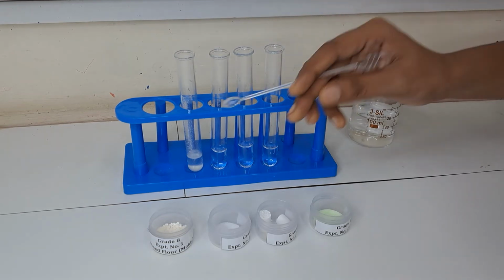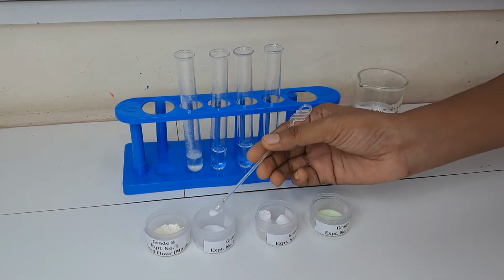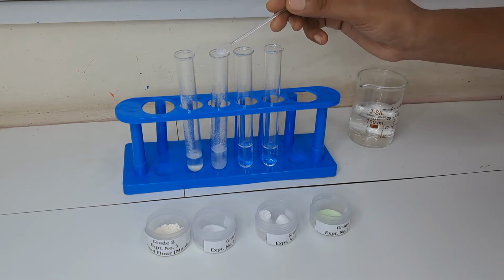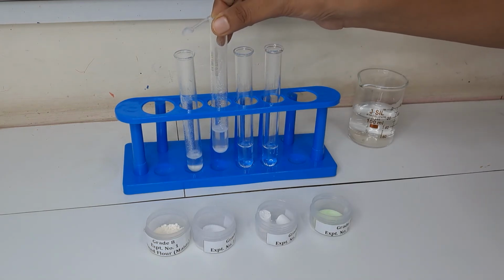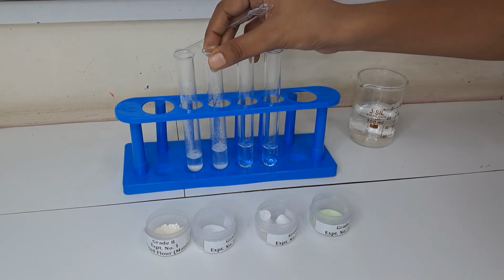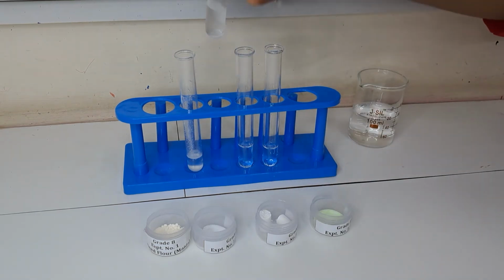Now in the second test tube, you have to add rangoli. Again, using your sense organs as we have mentioned for the first sample, you have to check what exactly happened when you added the rangoli in water. Whether bubbles appear, whether it floats initially or sinks directly, you have to observe. You can check whether the temperature is increased or not by touching the bottom of the test tube. Whether there is noise or not, you can observe carefully.